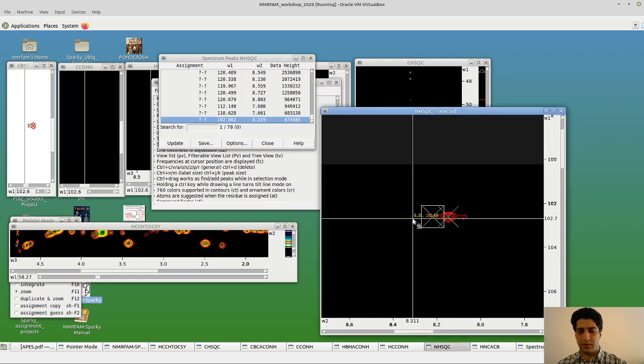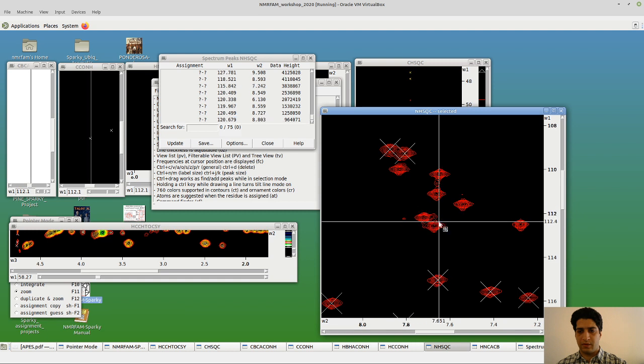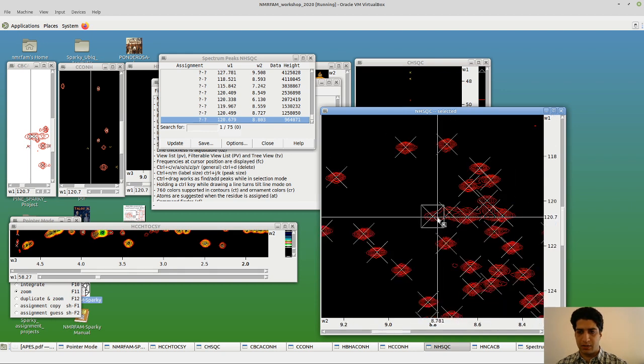Next one, next one, next one, and here, this doesn't seem right. Okay, we can delete this one too.